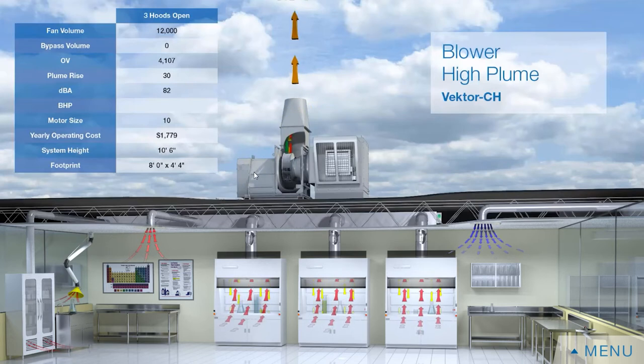The disadvantage of a centrifugal fan is footprint. Because the fan and bypass plenum are parallel to each other, they take up more real estate on top of the building.